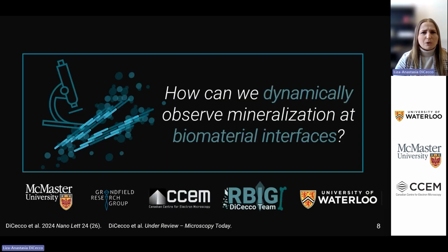And so this research project really started with us asking how we can dynamically observe mineralization at biomaterials interfaces. We recently published a perspective on the topic in Nano Letters, and we've just expanded this work by submitting a full-on methodology piece with Microscopy Today, which is set to come out, I believe, in March, so pay attention for that, which will have a lot of these details if you're interested in this work.